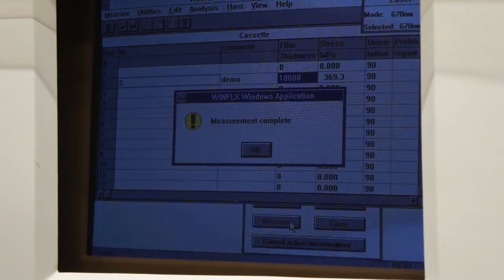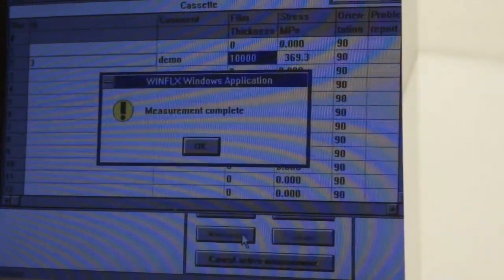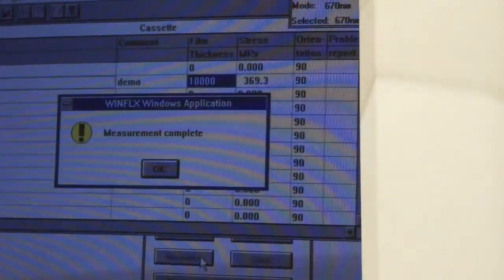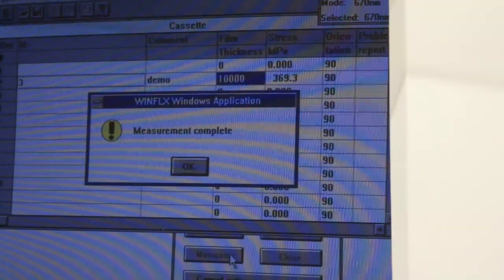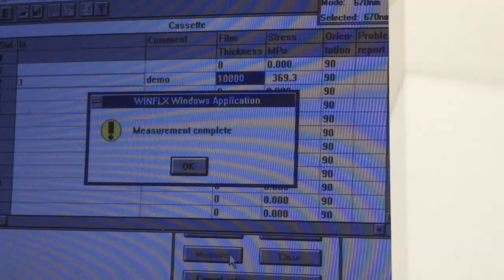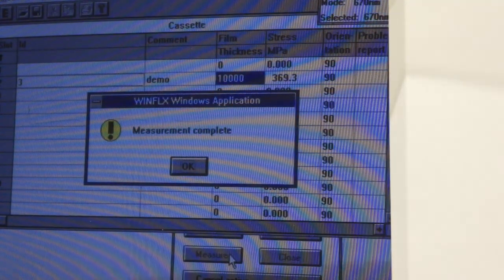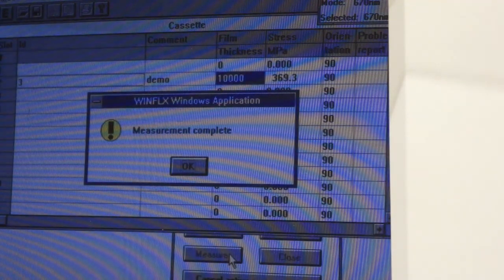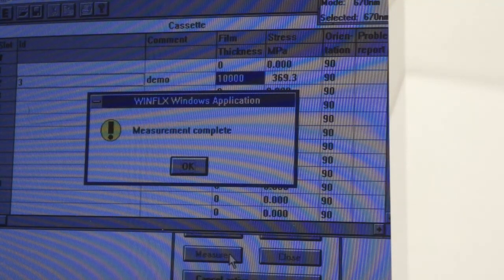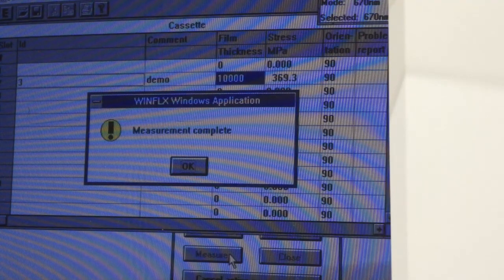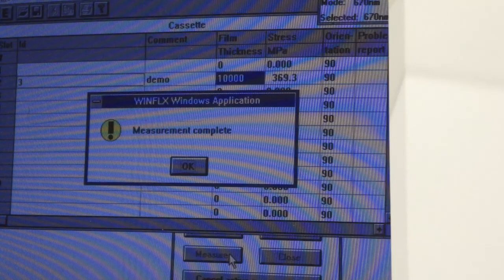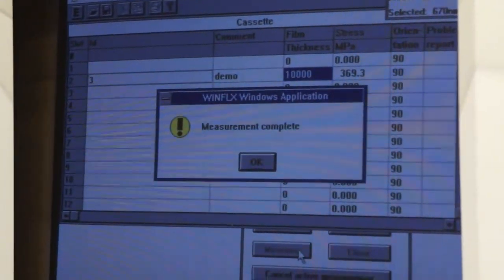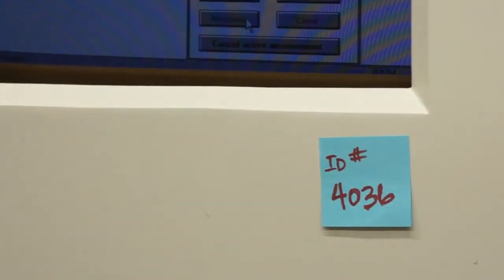It says here measurement is complete. And we're looking at 369.3, real quick calculation there. And we're looking at 2.2%, so well within our spec, and this concludes our proof of life video of ID number 4036.